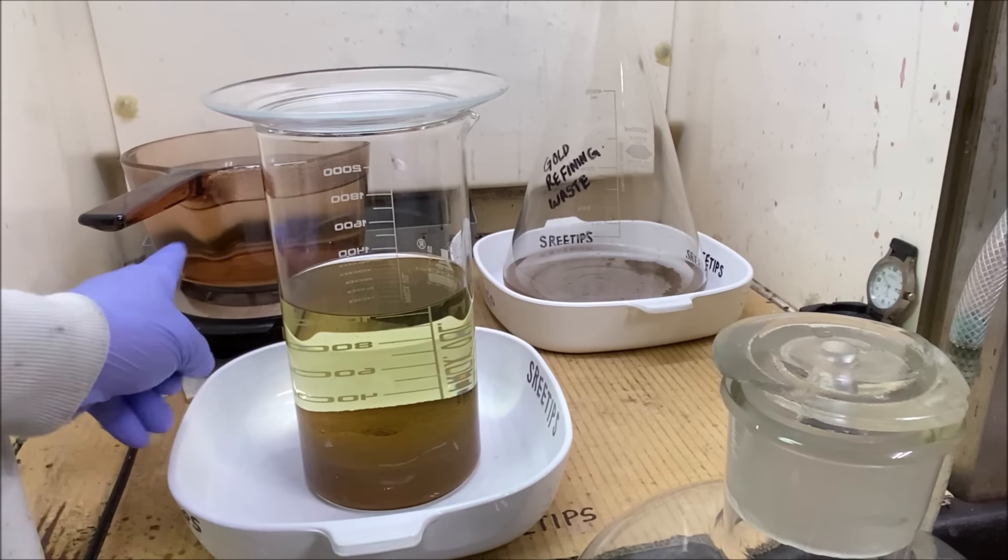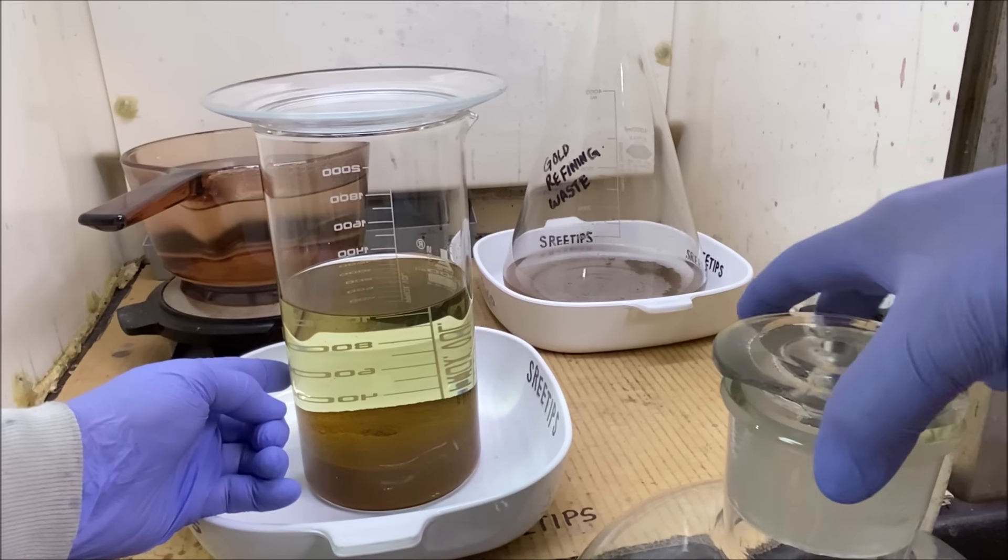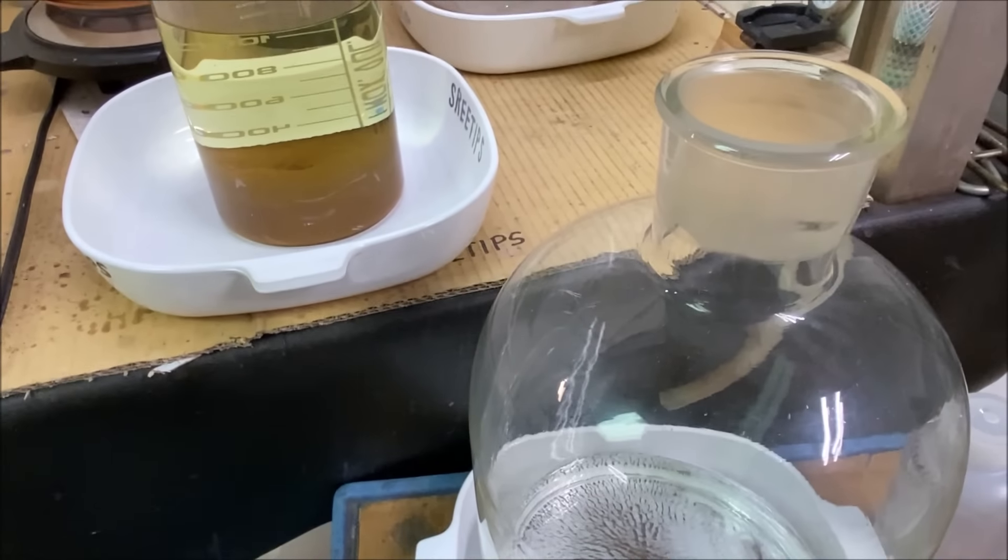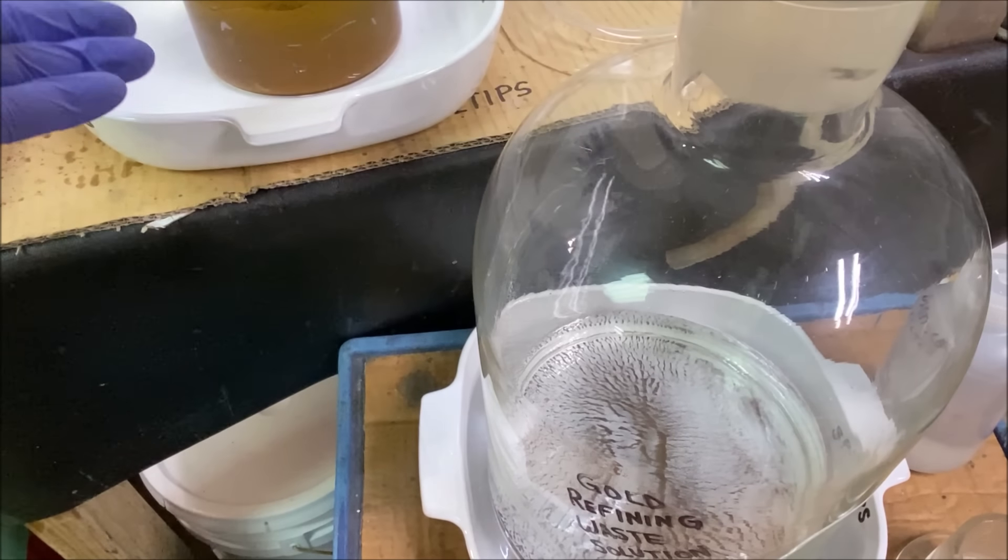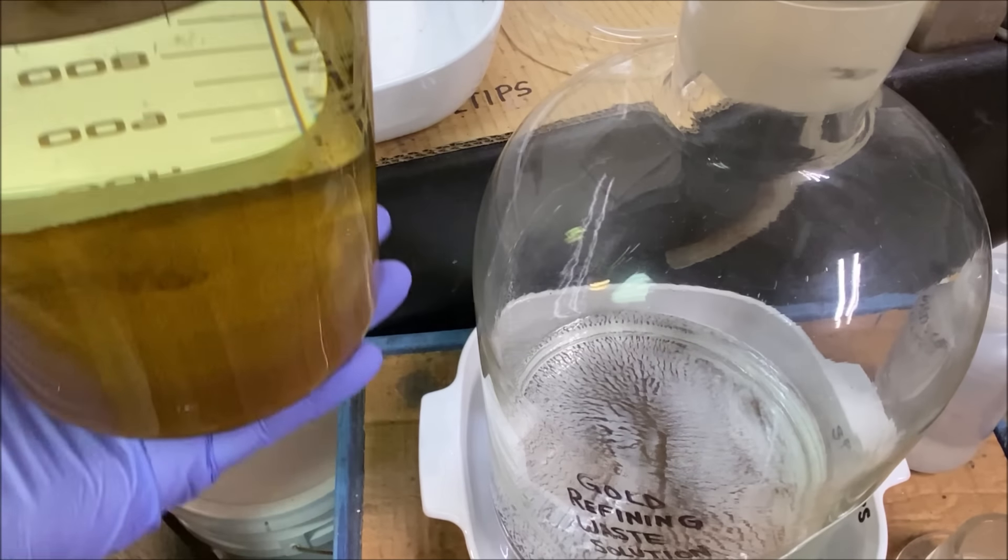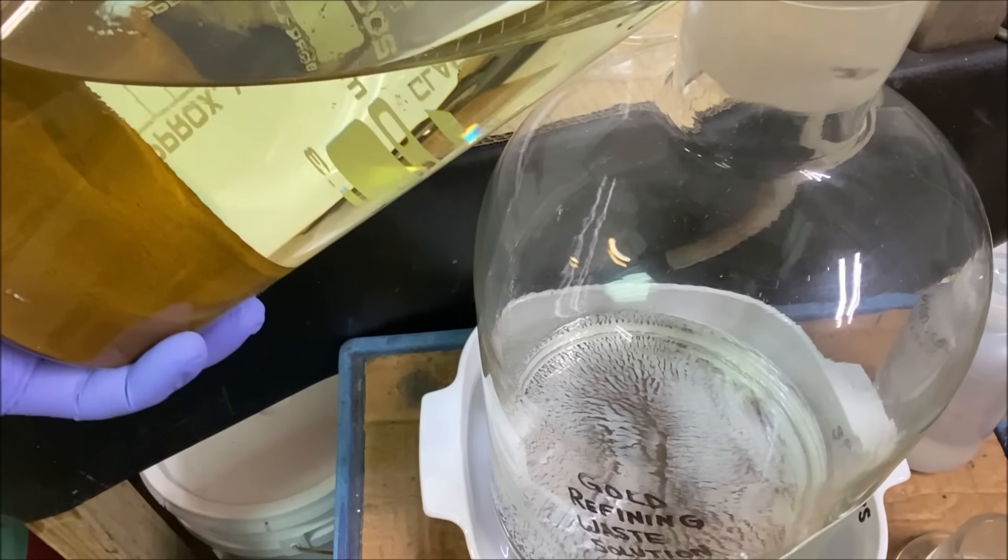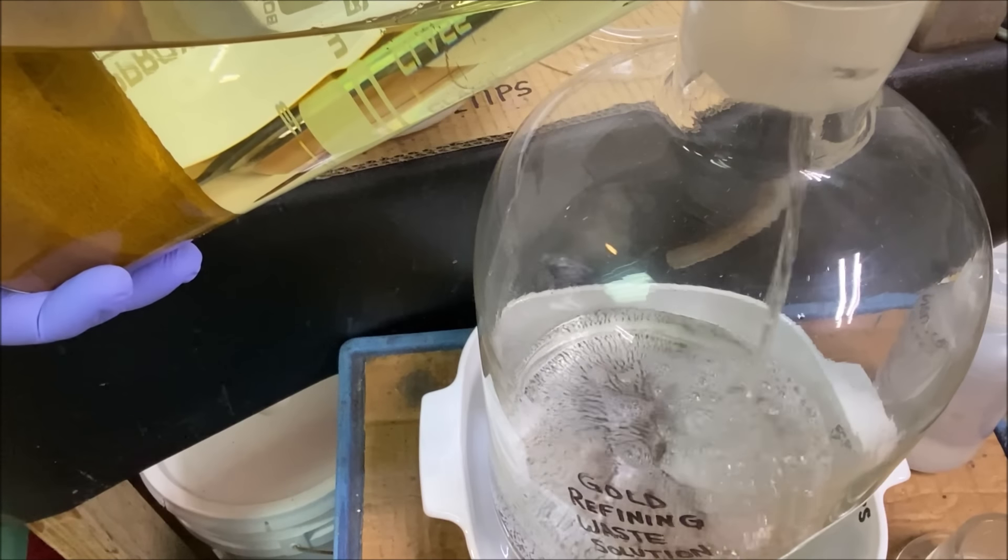Rinse all that off of there. I'm going to rinse the gold off with some boiling tap water, but first I'm going to pour this off into a gold refining waste container. This waste container is not heat resistant, so I'm going to pour off this initial amount of waste into this non-heat resistant waste container.